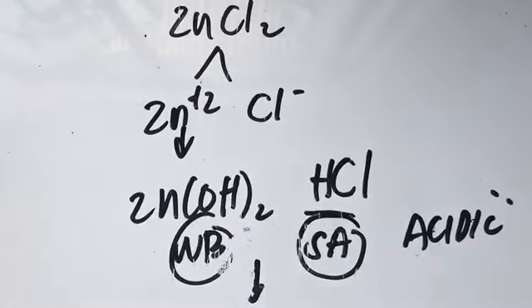So there is a very good experiment kasi tumama lahat ng datas natin dun sa theory na kung magiging acid ba siya or kung magiging base ba siya. Now, we can identify whether the aqueous solution of the salt can either be acidic, basic, or neutral, depending on its molecular formula.